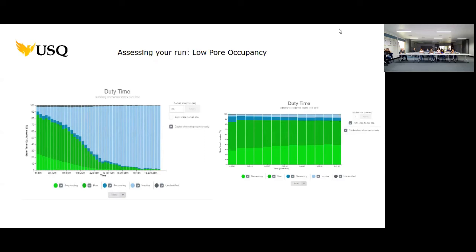So when you've loaded it onto the flow cell, there's not enough DNA there to sequence. The other possibility is that your adapter ligation hasn't worked. When you ligate on that sequencing adapter, if that step doesn't work and you don't have a sequencing adapter attached to your DNA, you can have all the DNA in the world, it's not going to get sequenced. So you could have a ton of DNA there, but no sequencing adapter ligated on.